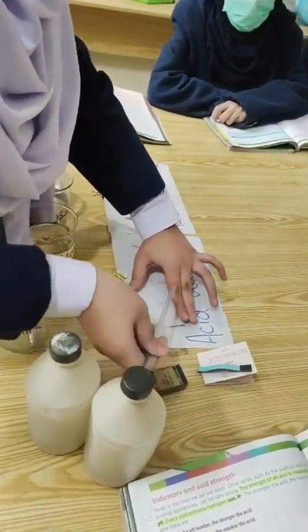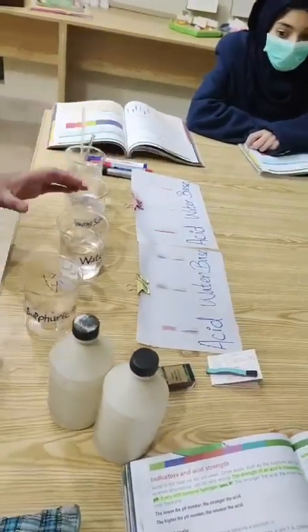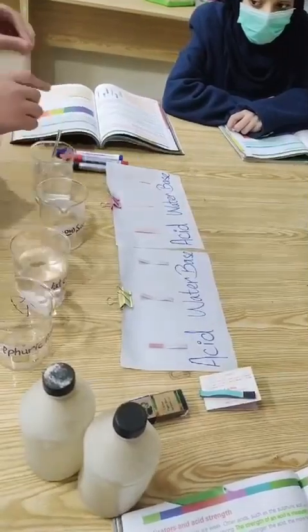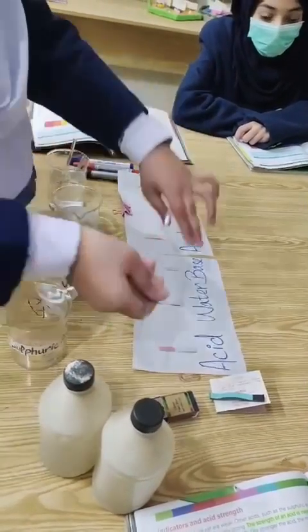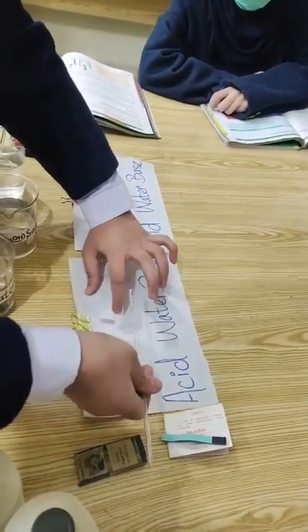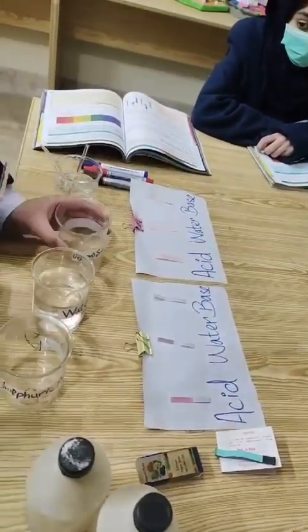Now we will see the blue litmus paper. We will see if blue litmus turns red. Now we have water — you can see there is no special reaction.